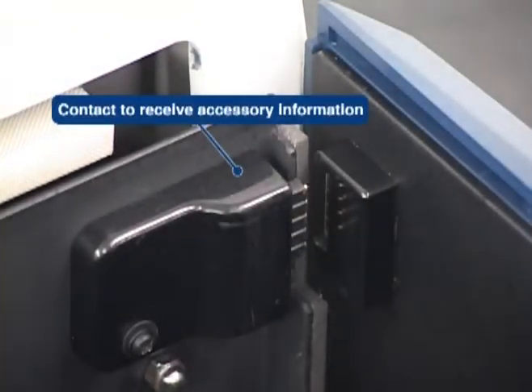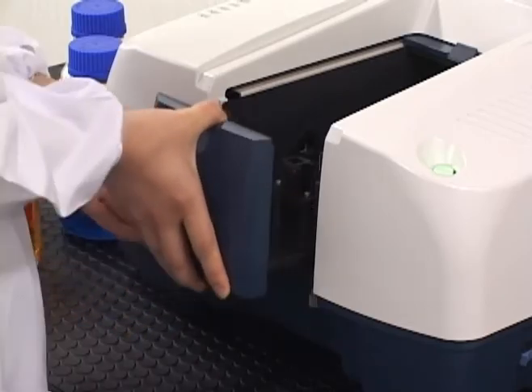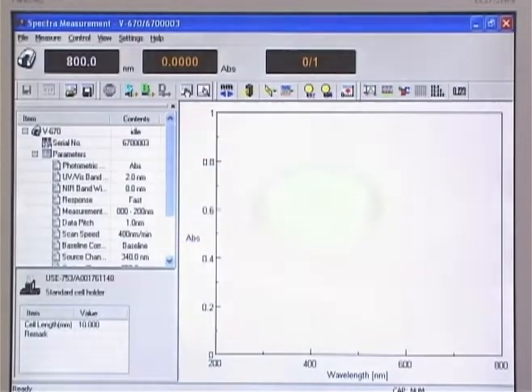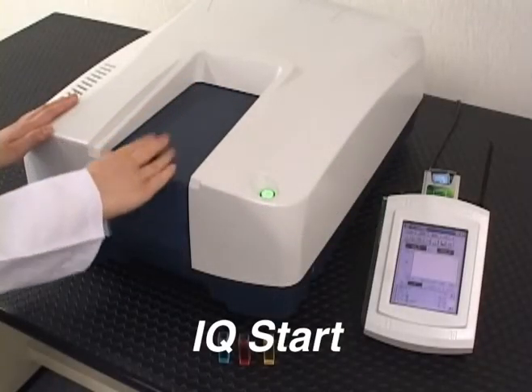New features for the V600 series instruments include automatic accessory recognition using the IQ Accessory function and IQ Start for immediate execution of routine instrument parameters. IQ Accessory automatically recognizes the accessory and initializes a registered software program. IQ Start begins data collection using the initialized software program after placement of a sample and a simple push of the start button.